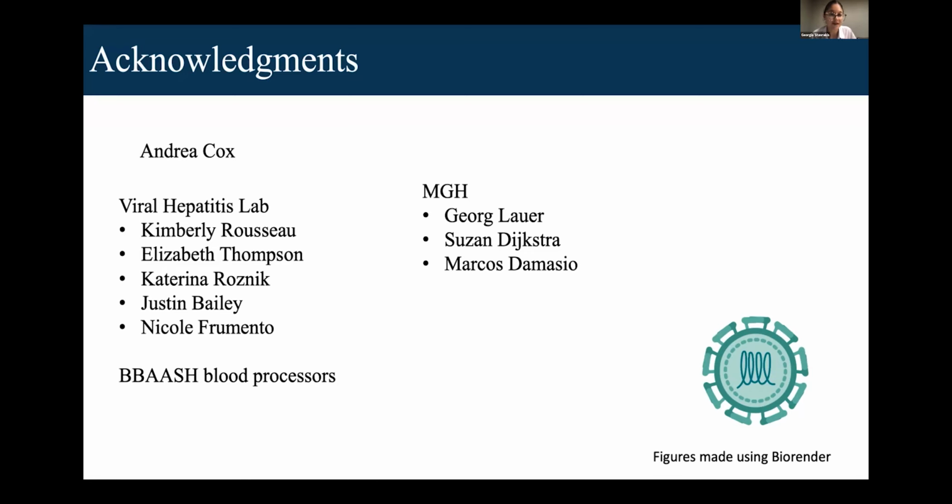Yeah, it was really just about flexibility. The other difficulty is that each participant recognizes a different combination of HCV epitopes. So we wanted the flexibility of being able to say, for this participant, I'll pre-conjugate these two epitopes to PE and APC, but for another participant, take one of those epitopes and put it on a different fluorophore. So that was really what it was about.